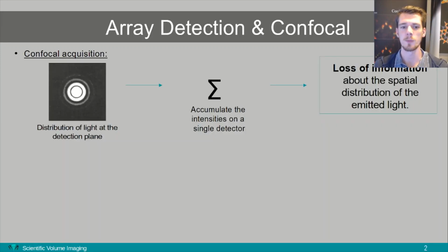In confocal point scanning microscopy, the sample is excited point by point, and the emitted light of each of these points is then captured with a photodetector. This information is then converted to an electrical signal, which is saved as an intensity value for each pixel inside your image.